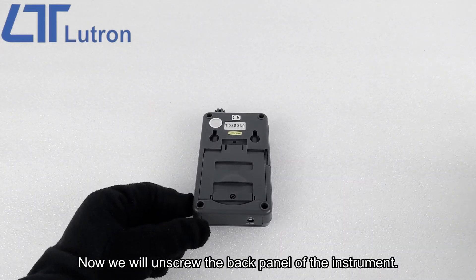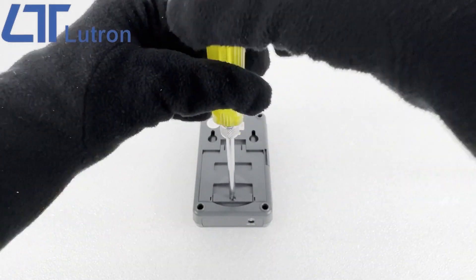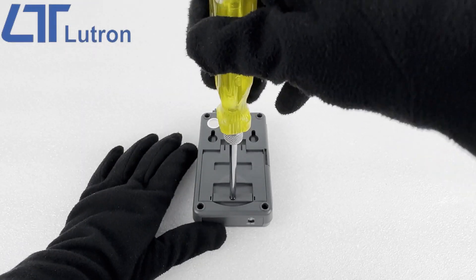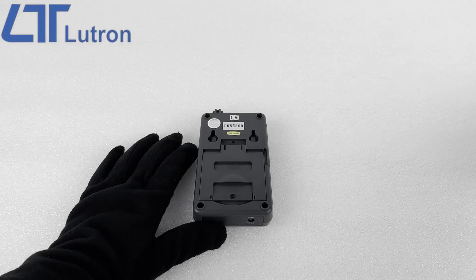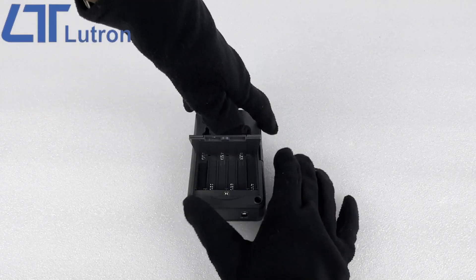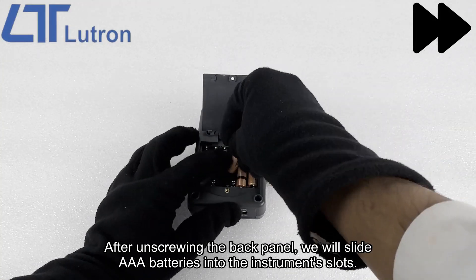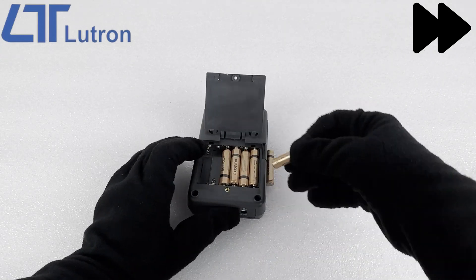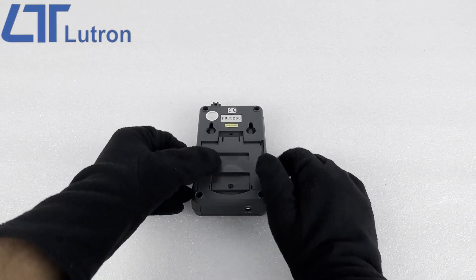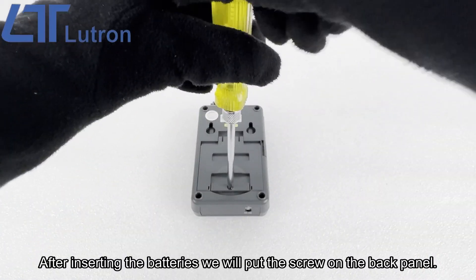Now we will unscrew the back panel of the instrument. After unscrewing the back panel, we will slide AAA batteries into the instrument slots. After inserting the batteries we will put the screw back on the back panel.